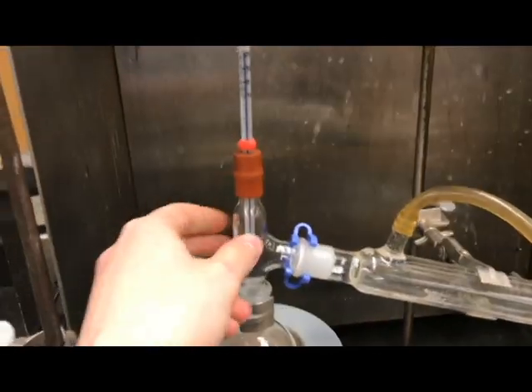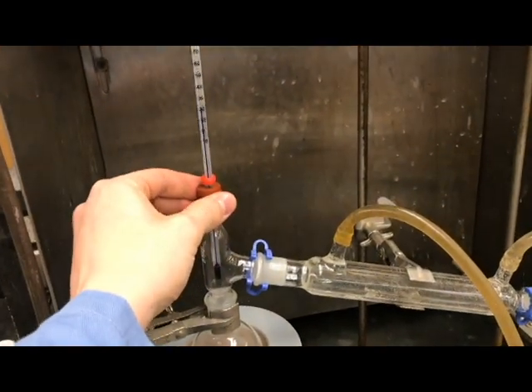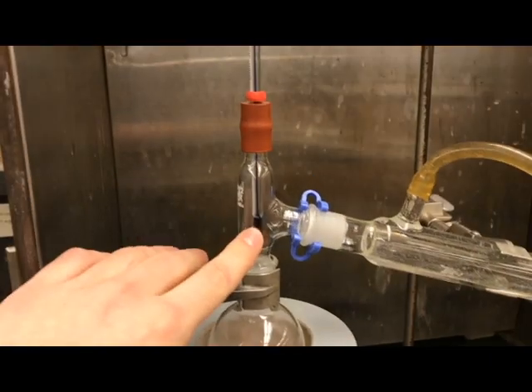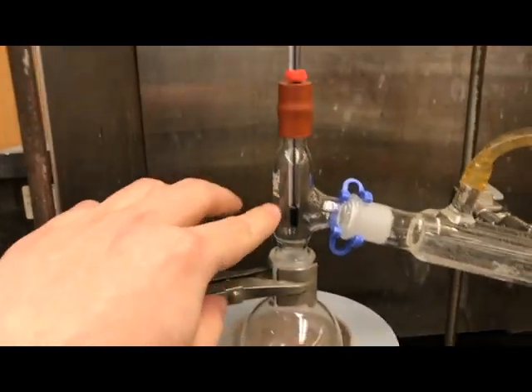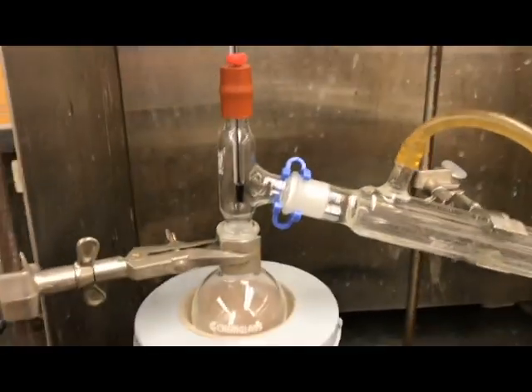So you have your three-way adapter hooked into your flask. Your adapter has your red fitment that holds your little thermometer. You do want to note that the height of the thermometer in this three-way adapter is important. You want it to be about halfway through or maybe two-thirds of the way down, just so you get accurate temperature readings.